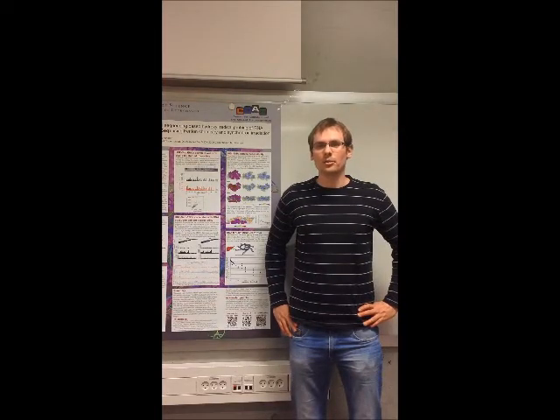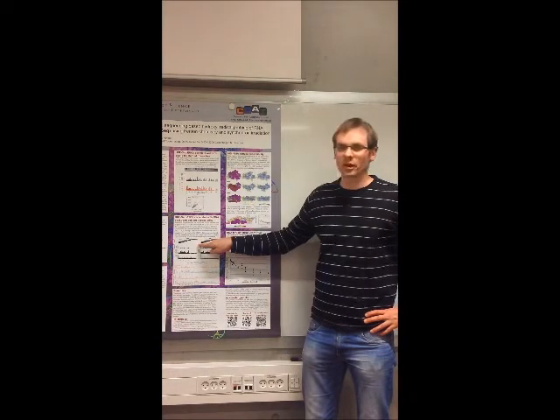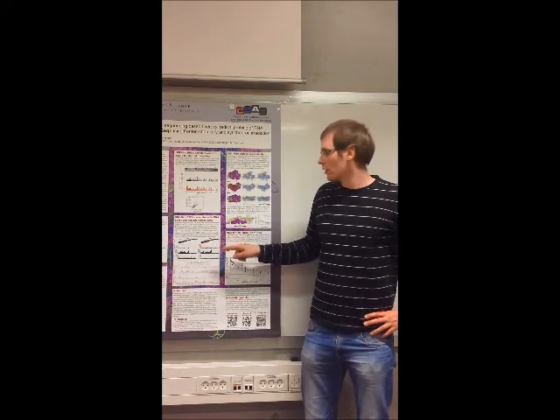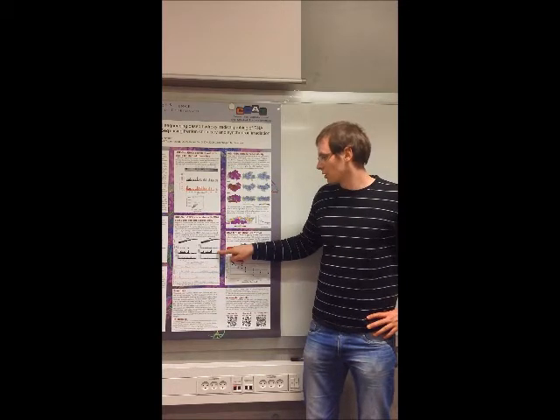After sequencing library preparation, sequencing, mapping, and EUC calculation, we obtained the information about the priming site and termination site of each fragment. This information was used to calculate the termination count and coverage at each ribosomal position.